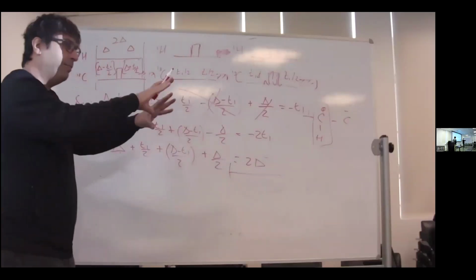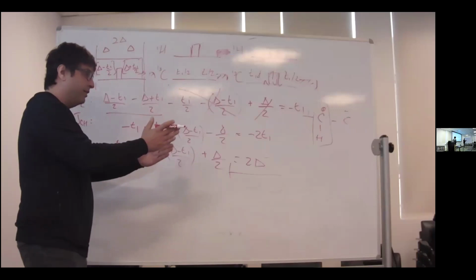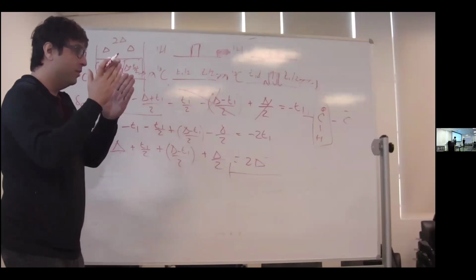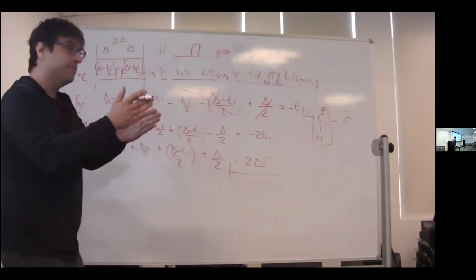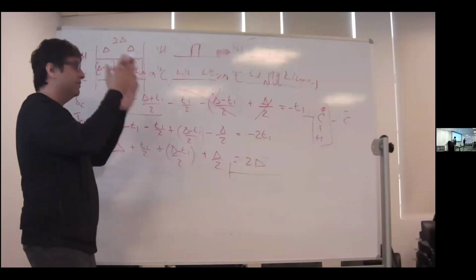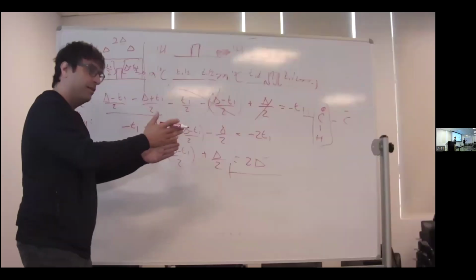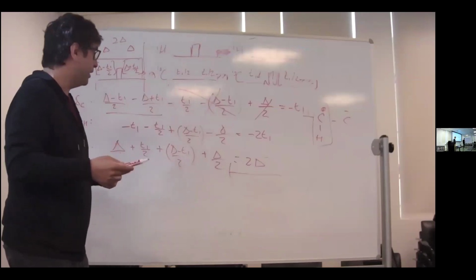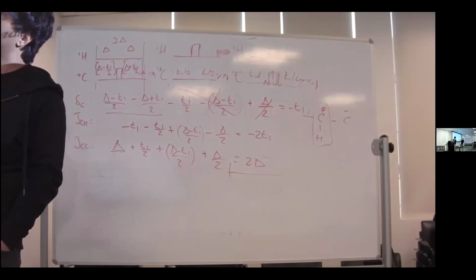Again, you see the way we design the pulse sequence is divided into two different deltas. In one delta, I have chemical shift and coupling evolution. In the other delta, I have only coupling. Right? So in one delta, I say both of them apply, the carbon chemical shift evolution and CH couplings. And in the second delta, I get rid of the chemical shift. How did I get rid of the chemical shift in the second period? What is it about the second period that gets rid of the chemical shifts?